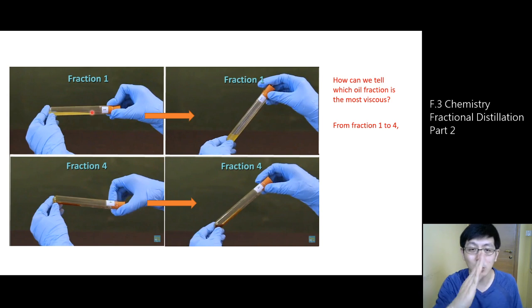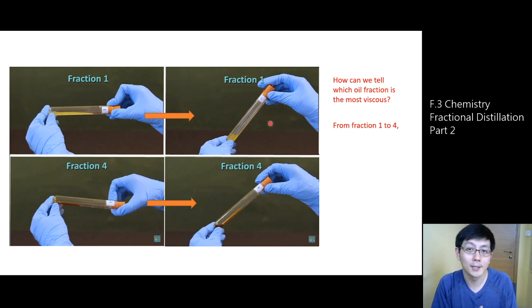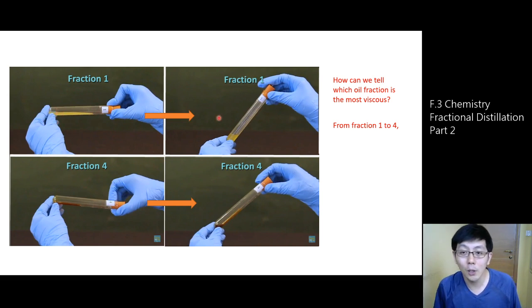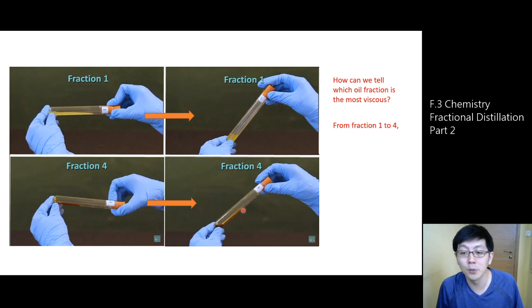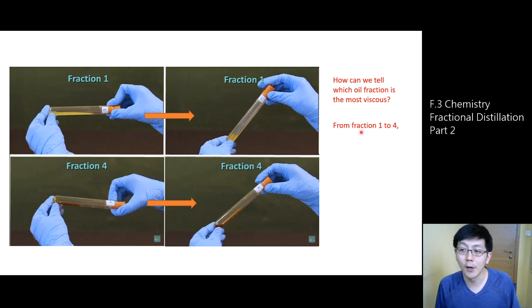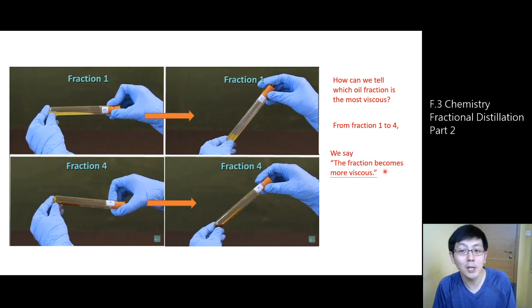We place the test tube horizontally to see how long it takes for the liquid to flow from one end to the other. If we return the test tube to a vertical position, for fraction 1 the liquid drops immediately and leaves no trace. However, for fraction 4, some liquid sticks to the wall and flows slowly back to the bottom. So from fraction 1 to fraction 4, the fraction becomes more viscous.